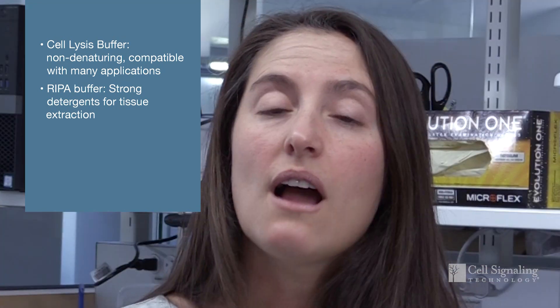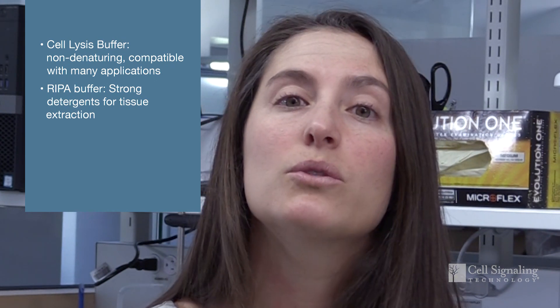RIPA buffer contains NP-40 and sodium deoxycholate. We generally recommend this buffer for tissue extraction because it's a harsher buffer and it can solubilize nuclear membranes. When using either of these lysis buffers, it's important to obtain your protein concentration after sonication and centrifugation to remove cellular debris.